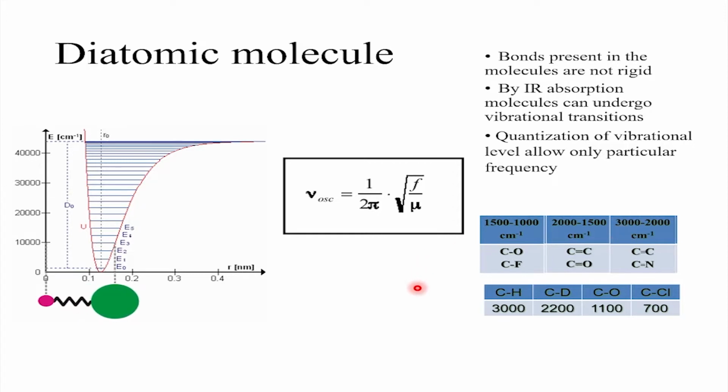So this is what happens once you change the bond strength or the mass of a diatomic molecule. Until any of these things are changed, it can vibrate only at one particular frequency. Now, what happens when a diatomic molecule vibrates? If you consider a carbon-hydrogen bond, we always know that one side is carbon, one side is hydrogen, so there will always be a charge separation. Equal and opposite charges separated by a distance give you a dipole there. So when it starts vibrating, you can consider it as a vibrating dipole.